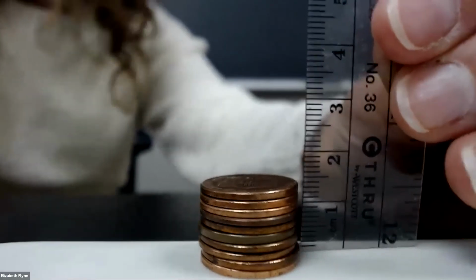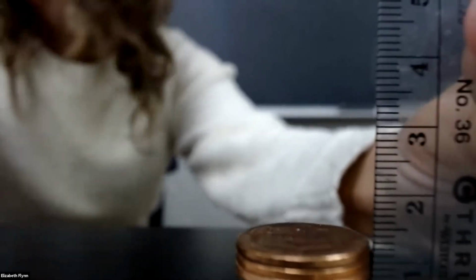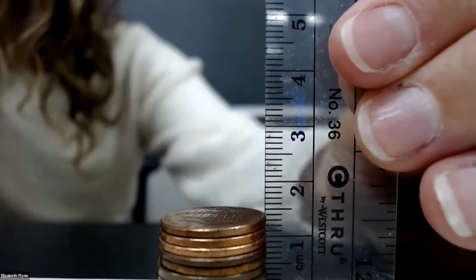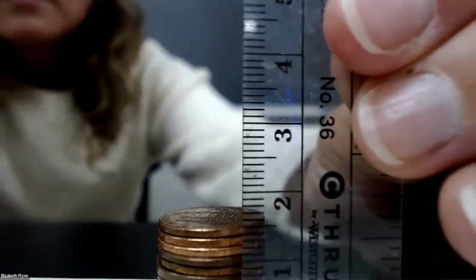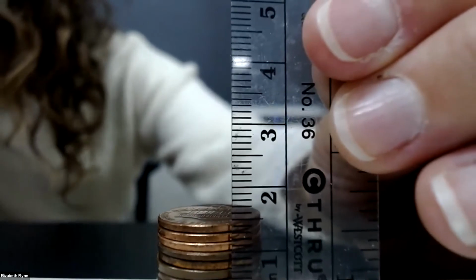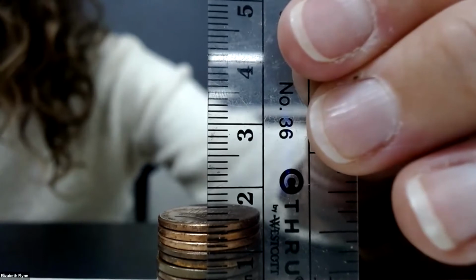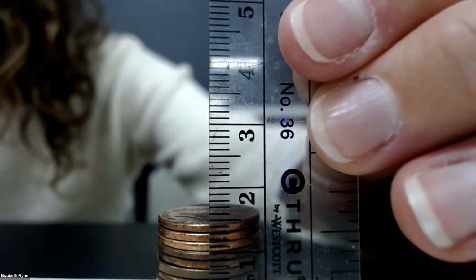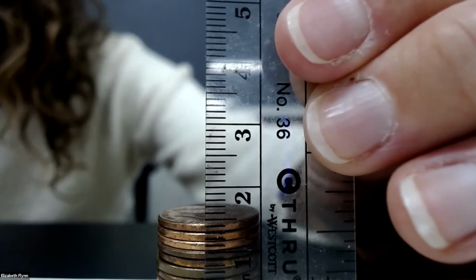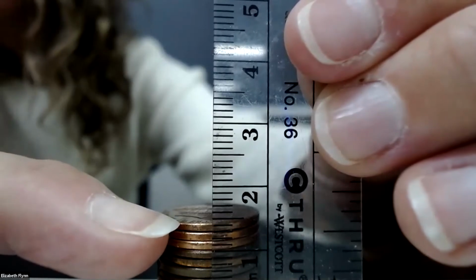So let me see if I can get this, a little off, but we'll do our best. Okay, I'm trying to line up, make sure you can see. So what do we say the height of this stack of pennies is? Let's make sure that we're looking at this edge right here, right?